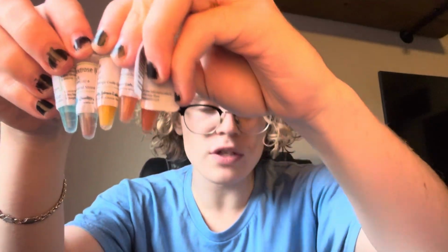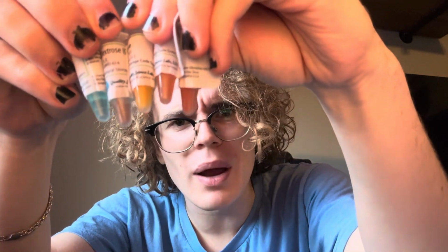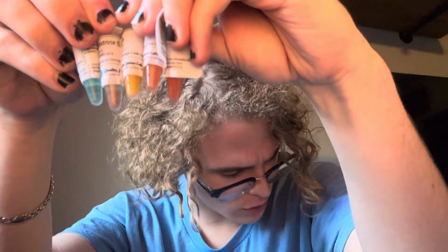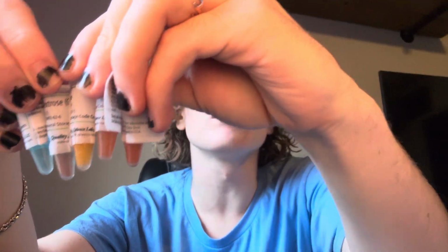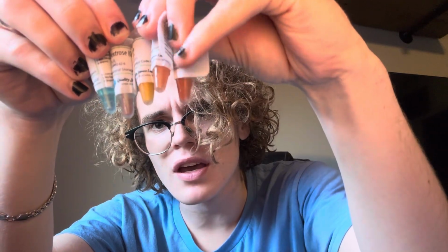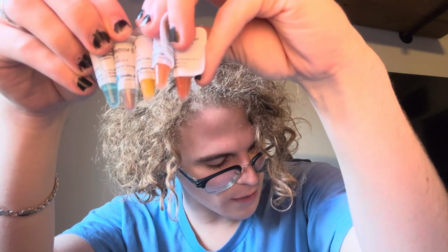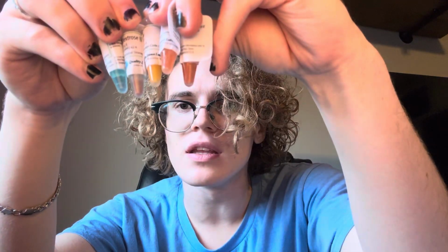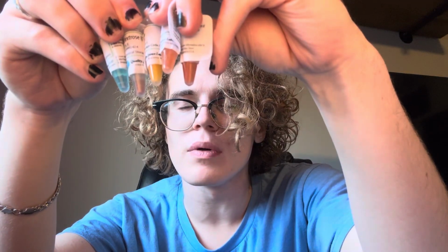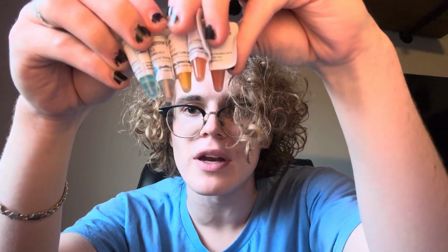We can see, of course, here on my left, potentially the right on the camera, I'm not sure, we've got that characteristic brown color that's going to indicate a pretty high presence of reducing sugars. Those are going to be sugars with aldehydes, like in the free chain form. They would have aldehydes and ketones that would be out there ready to react with that Benedict's reagent.